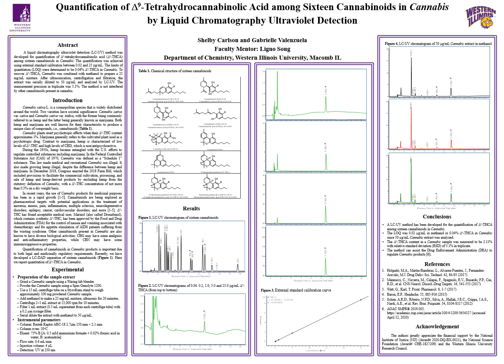Hi, my name is Shelby Carlson, and I'm presenting the poster on quantification of delta-9 tetrahydrocannabinolic acid among 16 cannabinoids in cannabis by liquid chromatography ultraviolet detection. The purpose of this poster is to create a liquid chromatography ultraviolet detection method for quantifying delta-9 tetrahydrocannabinolic acid among 16 cannabinoids in cannabis.